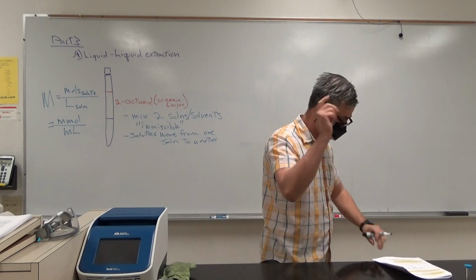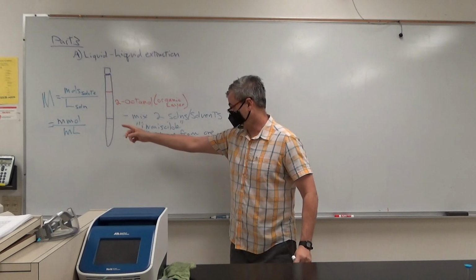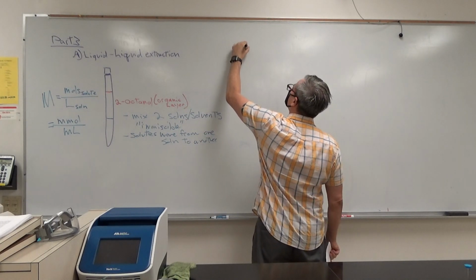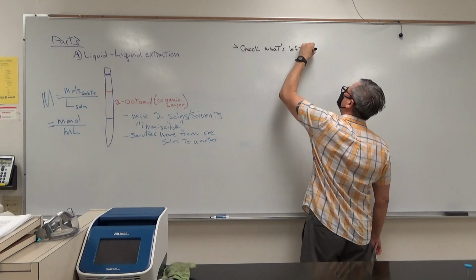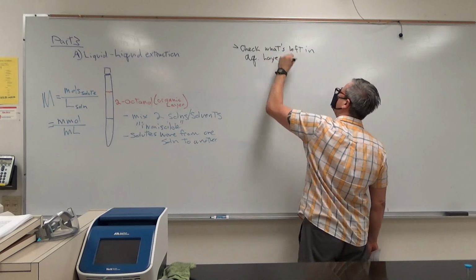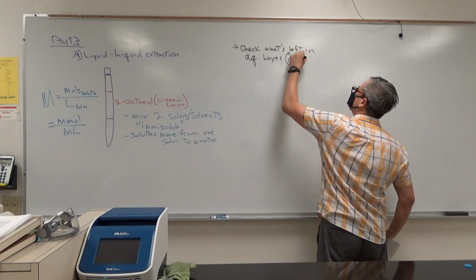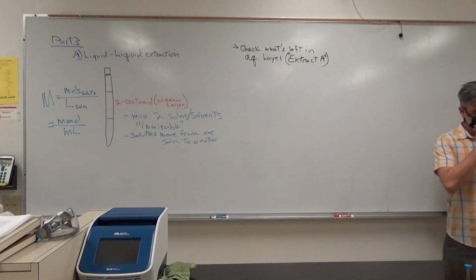Oh wait, nope. I'm not ready to do that yet. Okay. We want to know, by the way, how much is left in the aqueous layer. Okay. So then we're going to check what's left in the aqueous, AQ layer, bottom layer. Okay. This, by the way, we'll title that, what's left in the aqueous layer, as extract A. Titling it extract A because later on there's going to be an extract B. Okay?